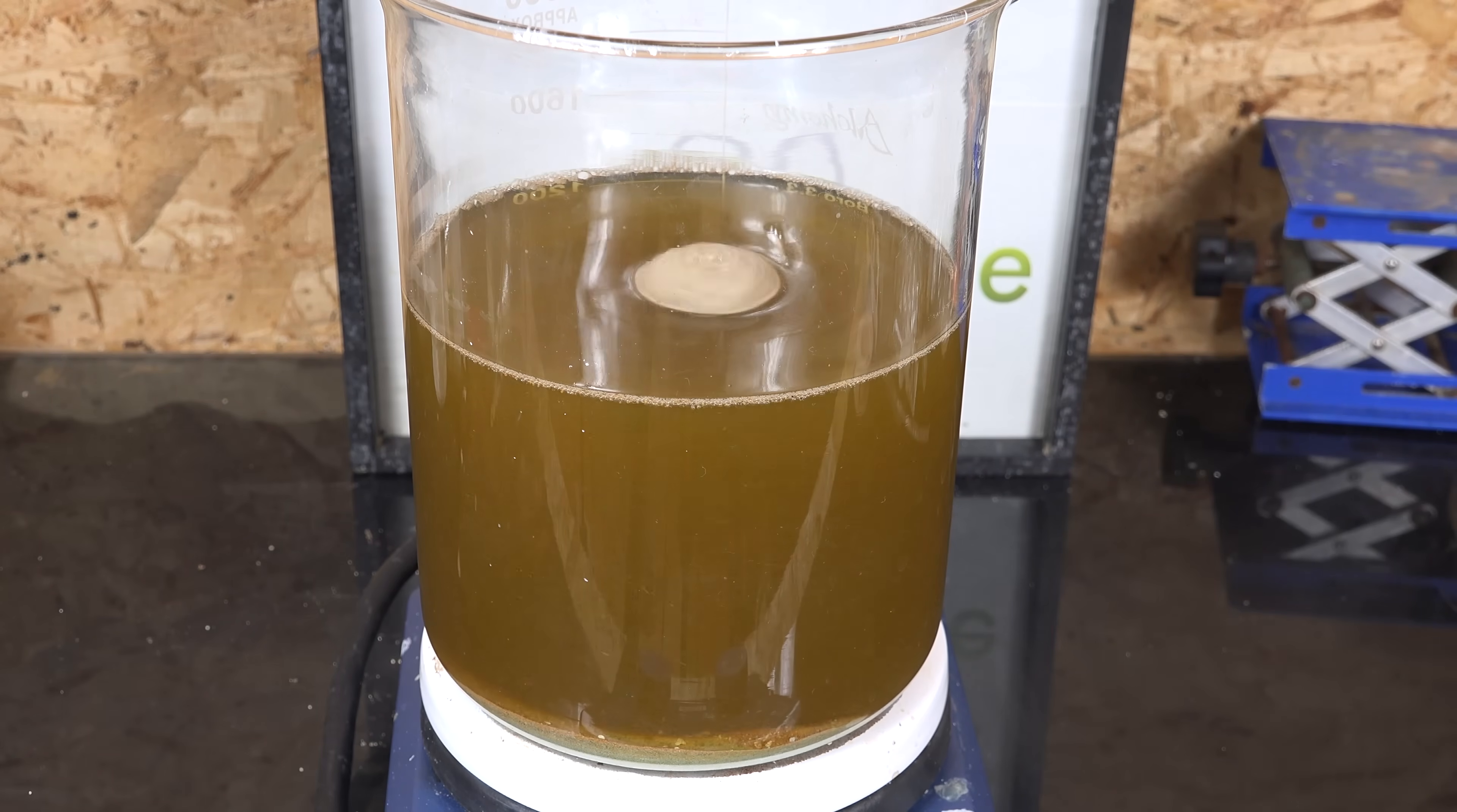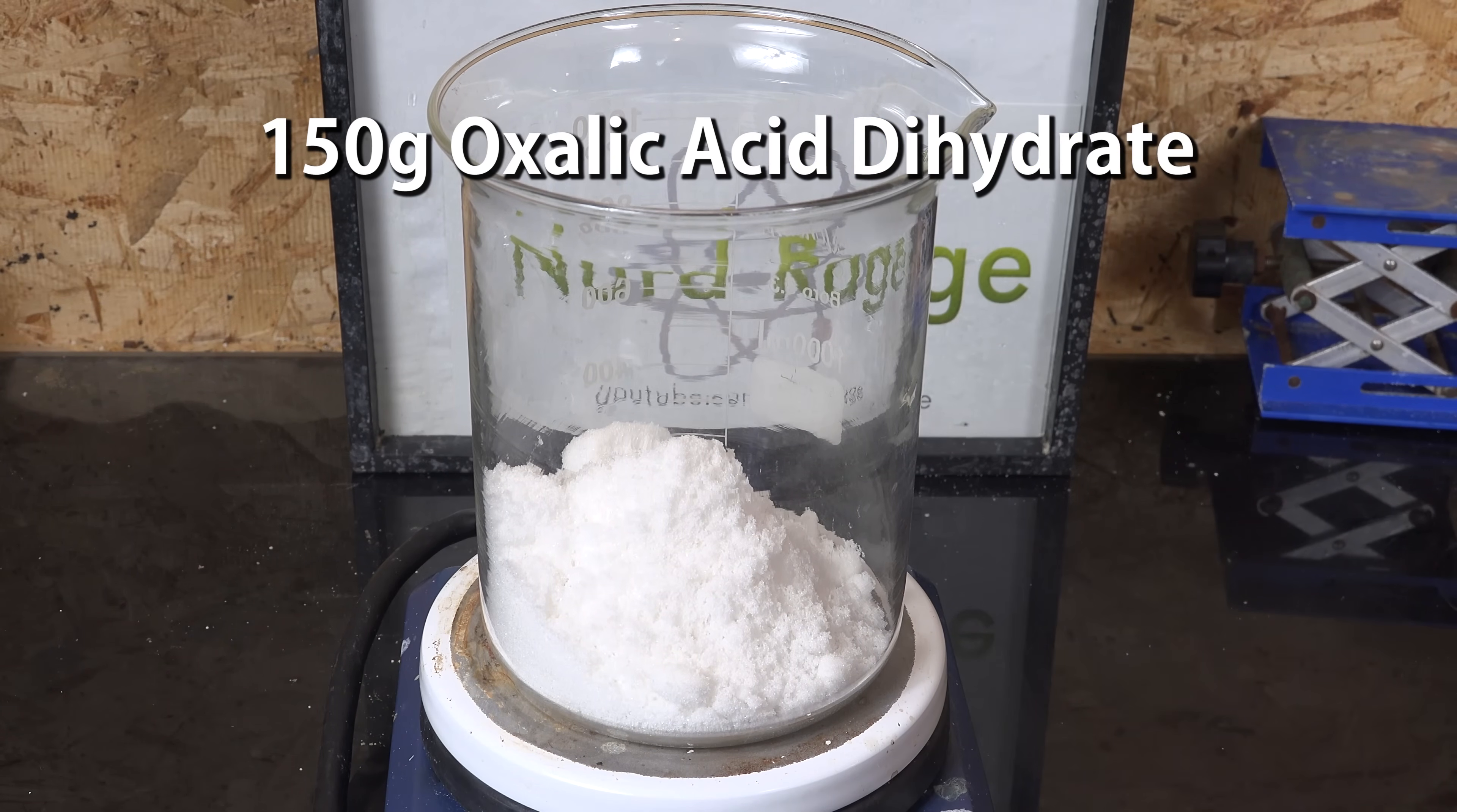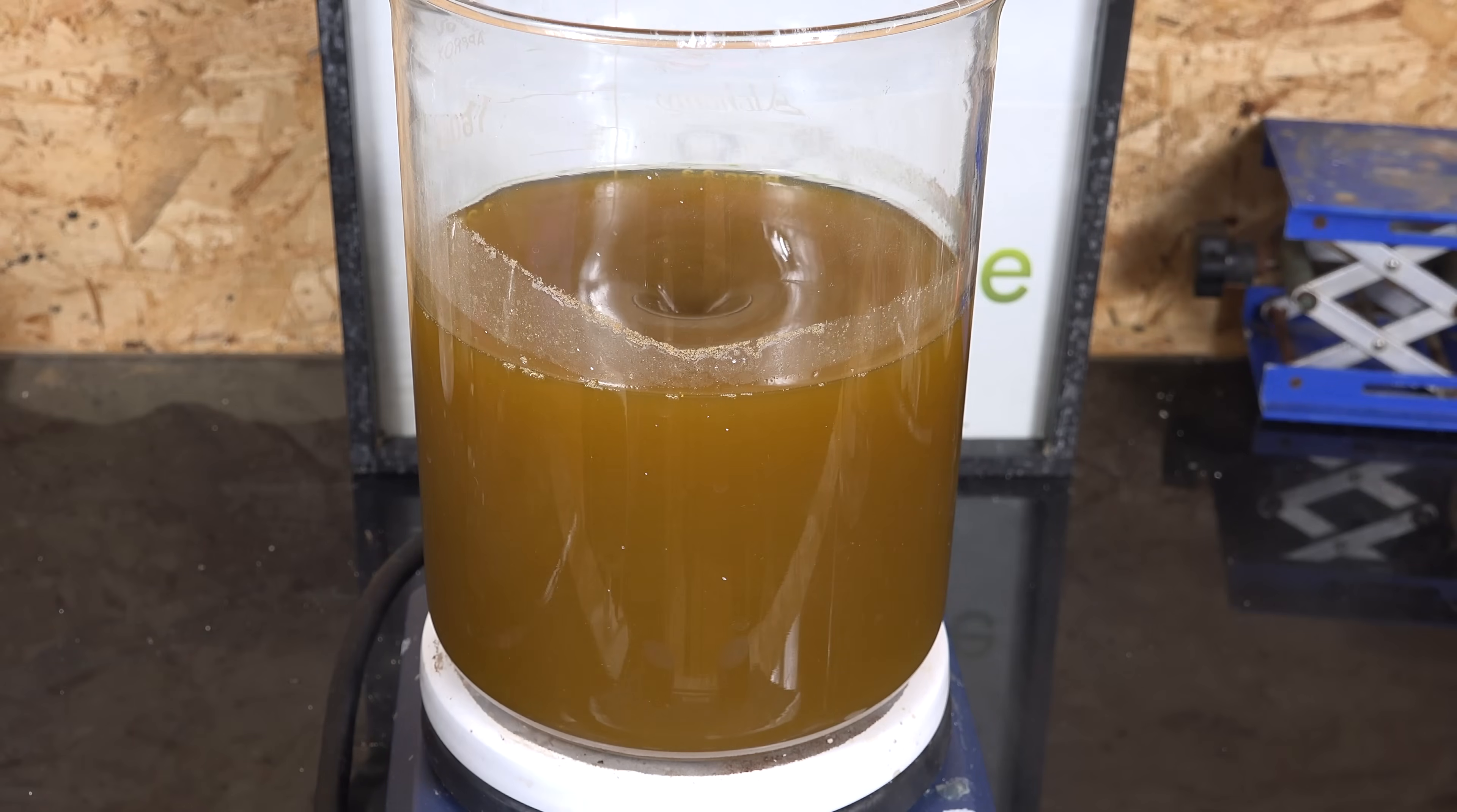You may need to gently heat it up to speed up the dissolution. While that is going, we get exactly half the mass of oxalic acid dihydrate or 150g and dissolve that in 300mL of water. We heat the oxalic acid to dissolve it. Then once it's dissolved we add that to the previous solution of iron sulfate.